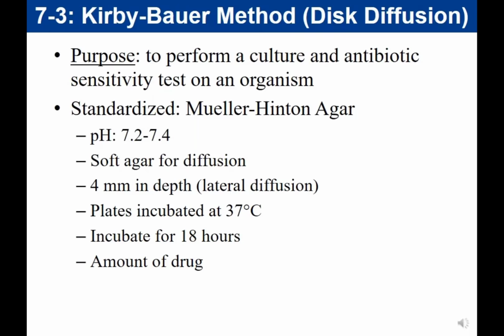Now, coming to our Kirby-Bauer. This is our disc diffusion, also known as an antibiotic sensitivity test. The purpose of this test is to perform a culture and antibiotic sensitivity test on an organism. Now, I know I wasn't the one that provided this lecture for you, but these slides were covered, and during the office hours this next week, if you have questions about it, we can go over it, but I wanted to kind of walk through and talk about what are the things that you need to know from this section.